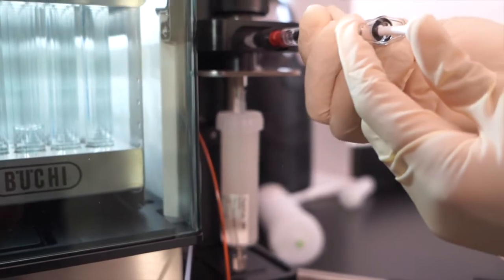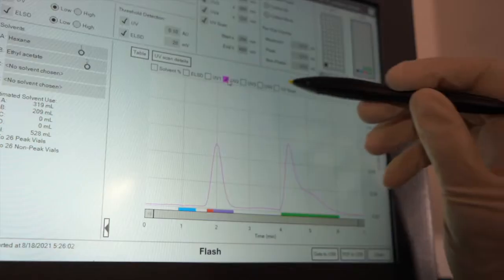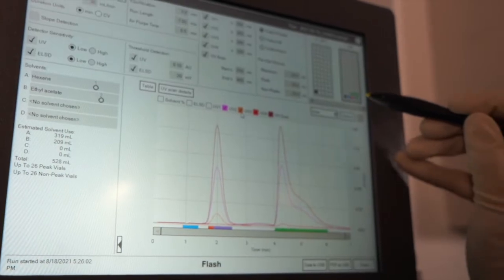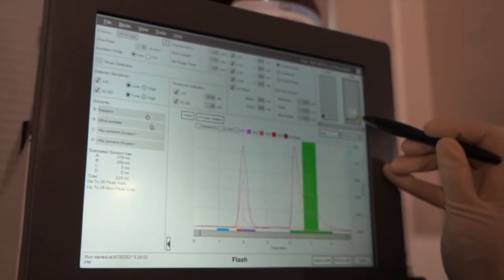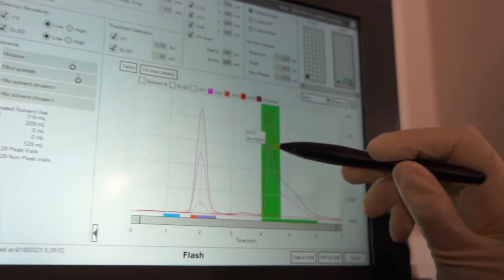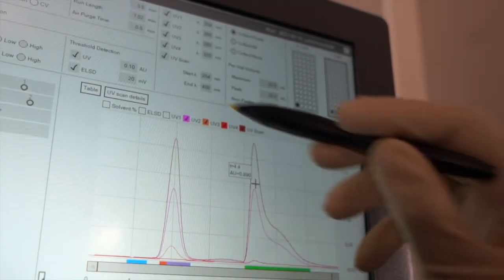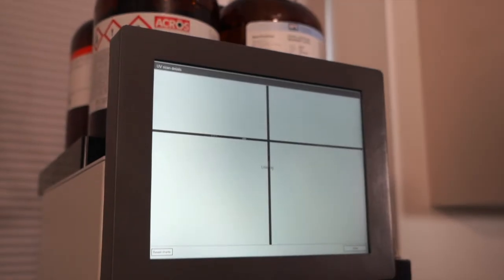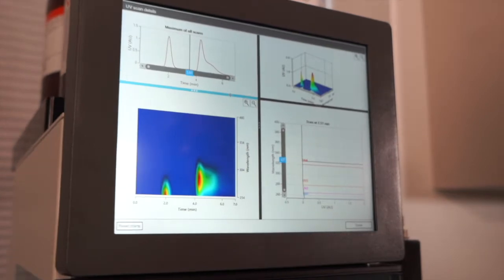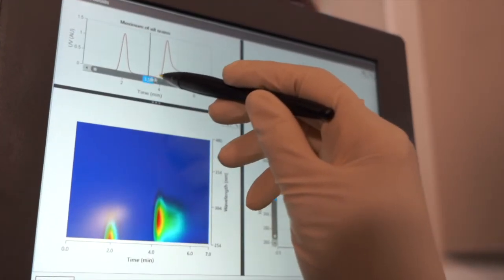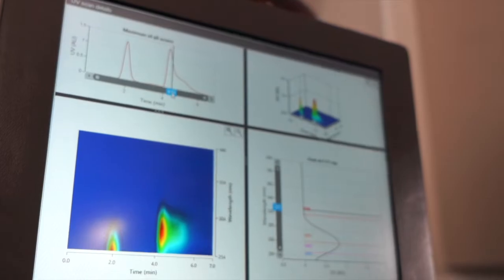Now the purification run has ended. You can open the file to view the chromatogram data. You can match the color-coded fraction and peaks. You may also view a detailed UV-vis scan graph to observe the photodiode array scanning and the UV profile of each individual peak. You can also easily export data by clicking on the export USB.